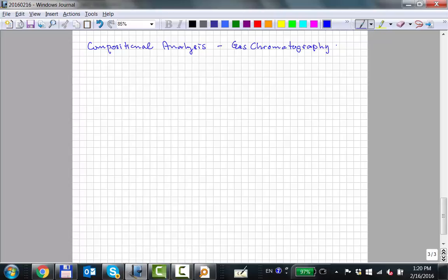I don't really understand what's going on, but I know the people who do, so I won't be too far off. We have these high-pressure samples that we collect, either bottom-hole samples, which are really high pressure, or separator oil samples, which could be anywhere from 10 bar to 100 bar, and separator gas samples, which also would be high pressure.